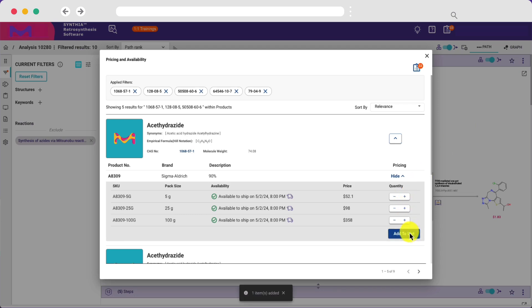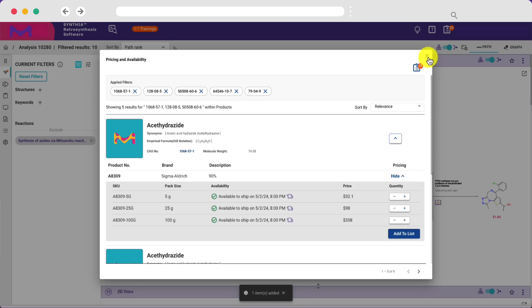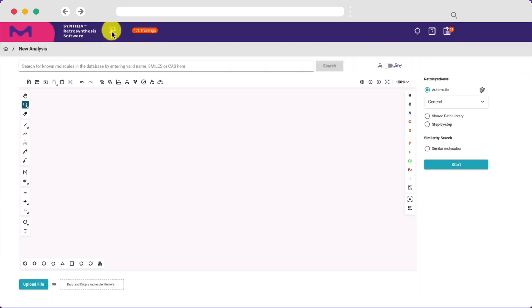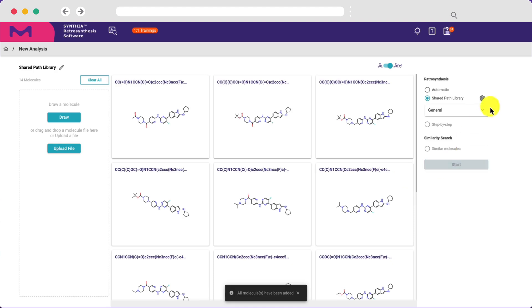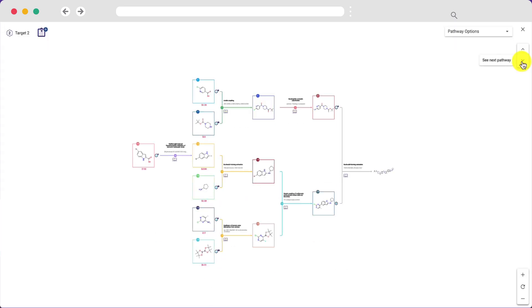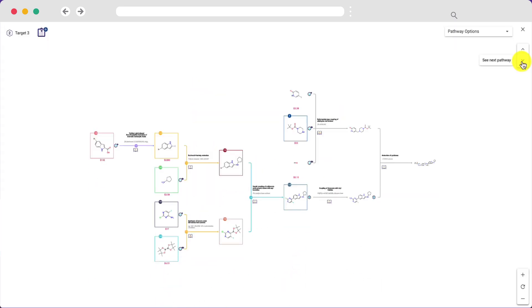For library pathway design, the shared path library analysis can be used to find convergent routes for up to 20 target molecules. Review the results to find common intermediates and identify reactions and building blocks that can be used to make multiple targets in your library.